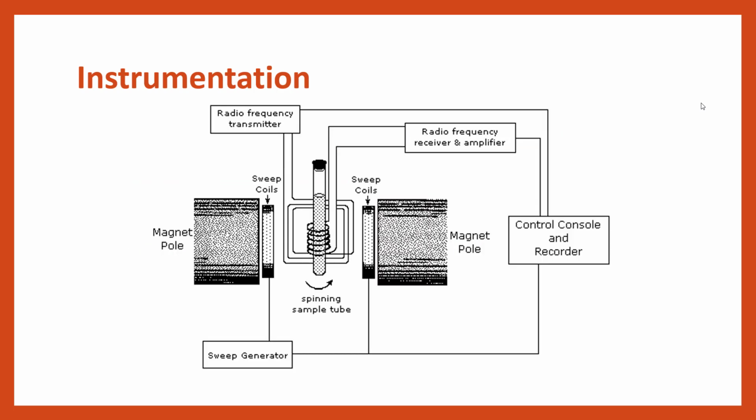So this is our general layout for instrumentation, okay? Typically, in the center here is our sample vial, usually these long, narrow glass tubes, and we'd have our compound of interest, which has to be solubilized in a particular type of solvent known as a deuterated solvent. And in NMR we can only work in the liquid state, okay? So anything we're working with has to be solubilized first.